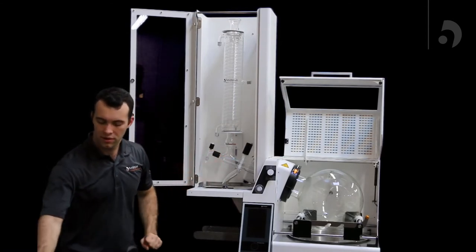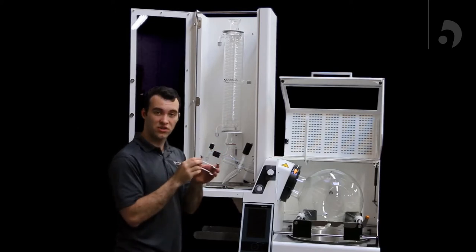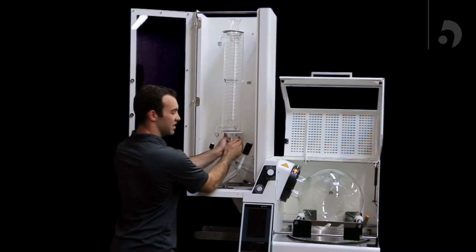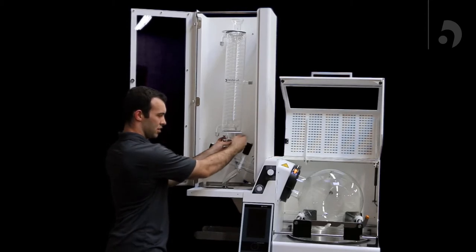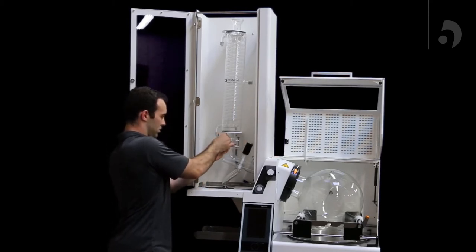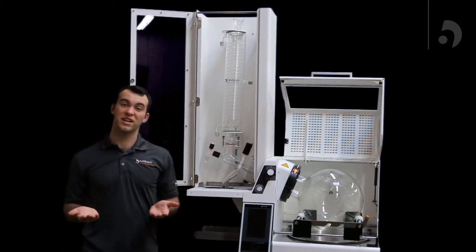Lastly, with the condenser, you're going to take your C-clamp, loosen it as far as you can, and use it to connect the distributor and the condenser. Once you've done that, tighten the spring, and your condenser is in there nice and tight.